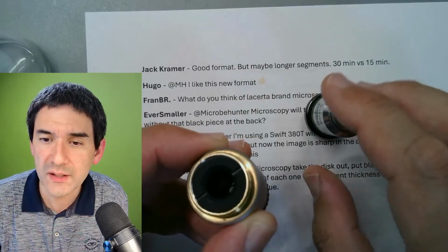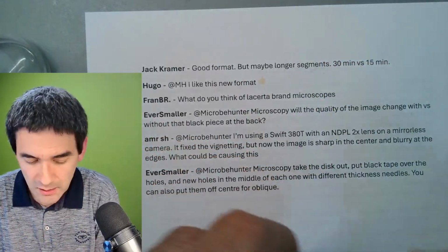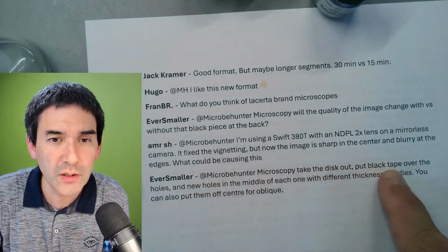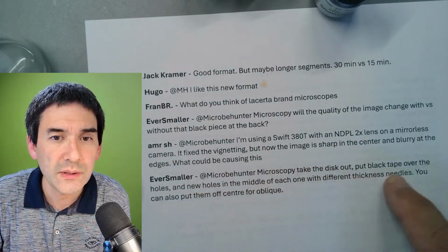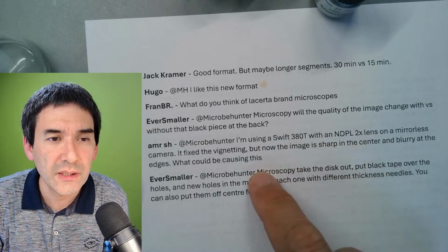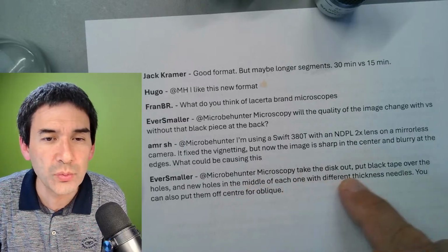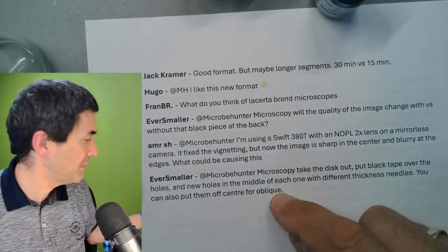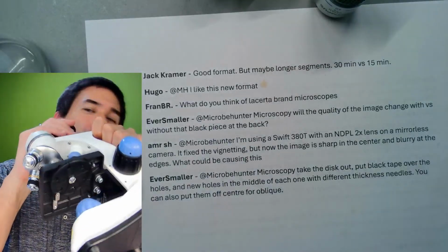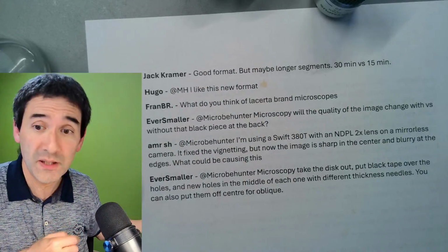Can you show us what polarization and DIC setup looks like on your microscope? I don't know how I'm going to do that. I'd have to swing this over. Thickness needle. Let me quickly read this here. Take the disc out, put black tape over the holes and make new holes in the middle, each with different thickness needles. Yes, that basically refers to this microscope over here on the bottom, where you can change the size here with black tape. That's also a good idea.